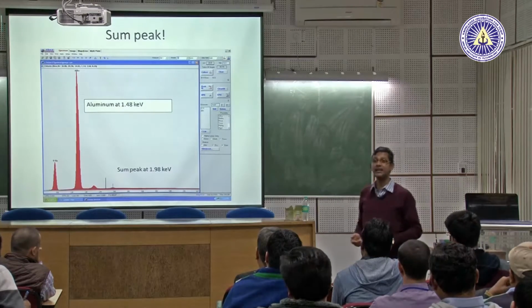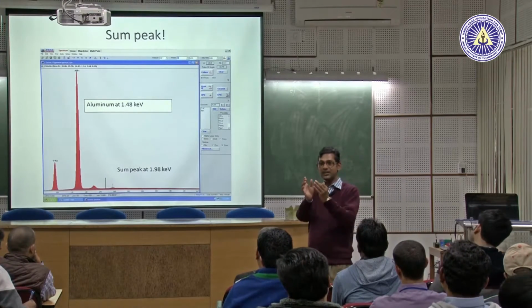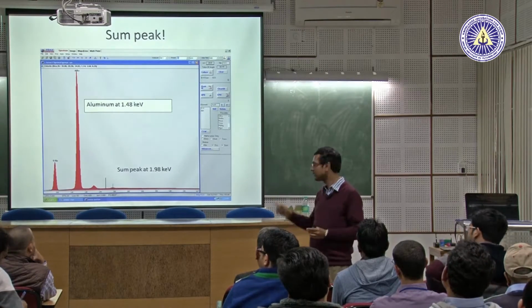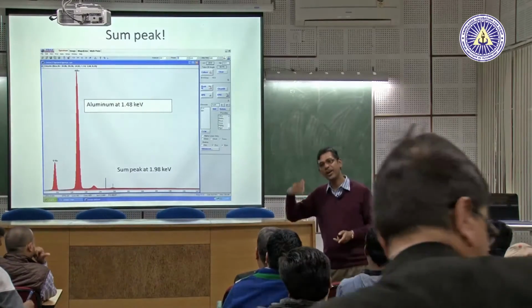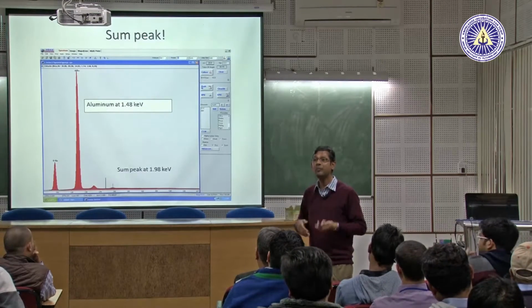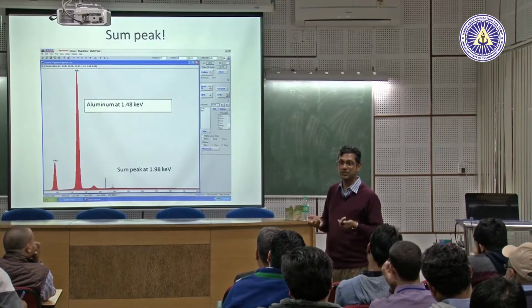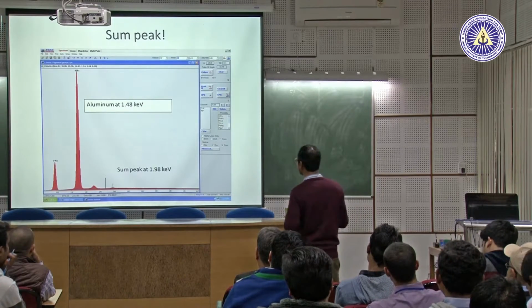The problem here is that the resolution is poor, because you can have a filter of 0.1 kilo electron volts or 0.01, 0.001, 0.0001. You can go down as low as possible. That will improve your resolution, but the cost will be higher and higher. Electronics does not come free or cheap, right? It's not a cell phone or anything like that.